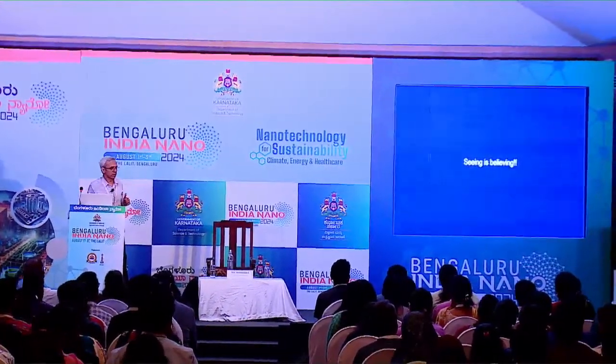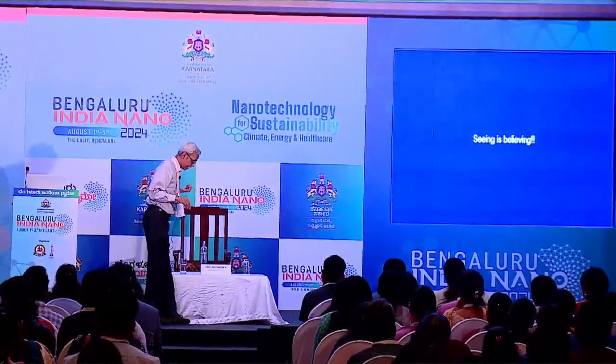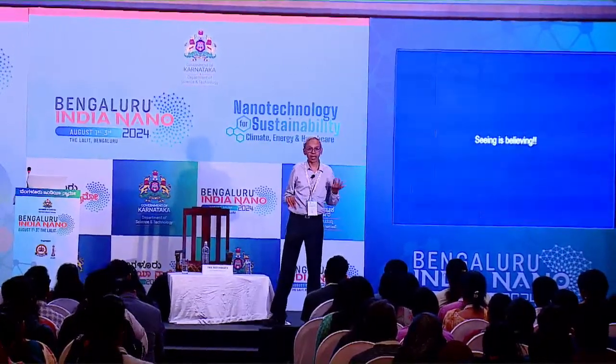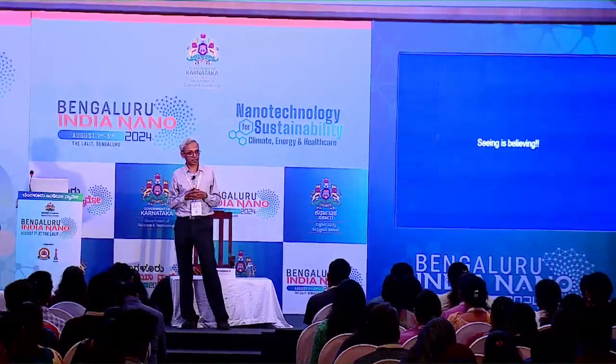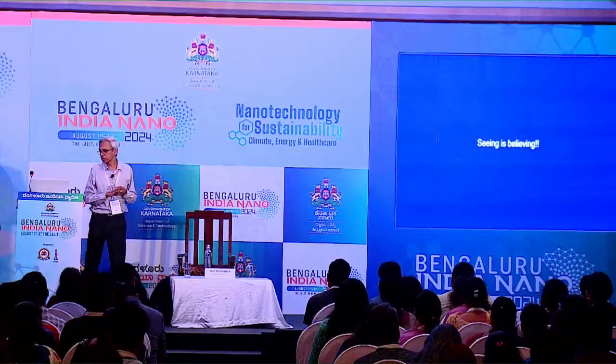I will just say that for characterizing nanostructures, the TEM is an indispensable tool nowadays because it can give you so much more information. Of course, we have to use different techniques for different kinds of characterization. But for spatial resolution, the TEM still basically reigns supreme.